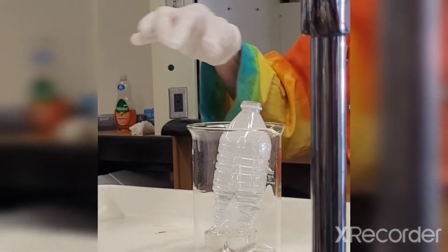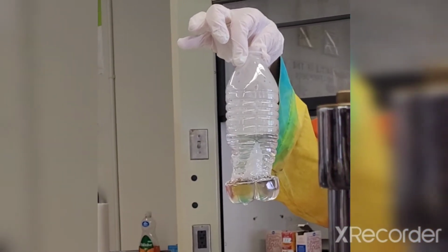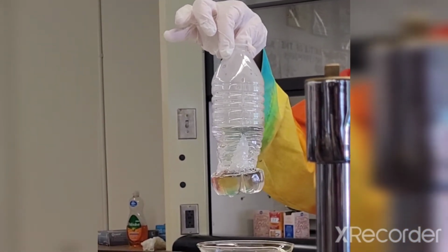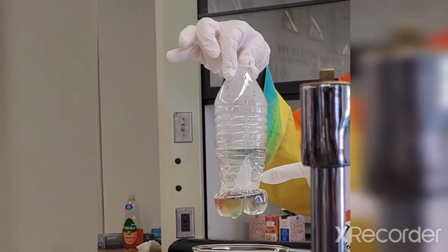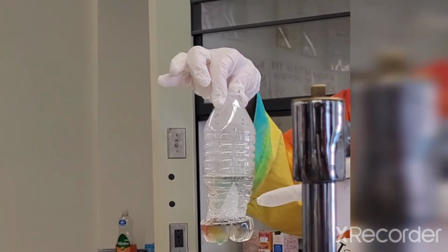Now, what did you see? The bottom melted. It generated so much heat that it literally melted the plastic. If you feel it, it's real super hot, but I wouldn't touch it right now because also it might be a little contaminated.